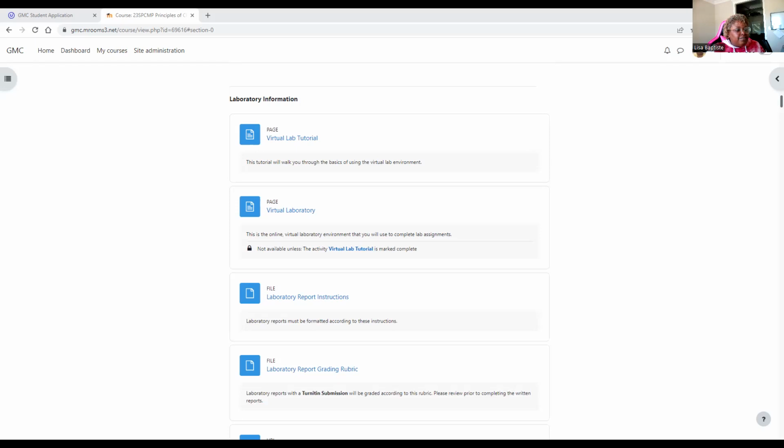So for this first part of the lab for the procedures, I'm just going to walk you through one of your trials just so that you know how to set this up. So you're going to need your water. You're going to need metal one, right? And see how you can click and drag and move it to different areas of your workbench. For your glassware for this first part, you're going to need a 10 milliliter graduated cylinder. You're also going to need a 250 milliliter beaker.